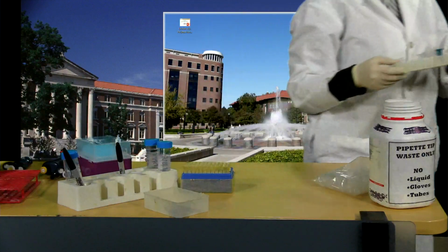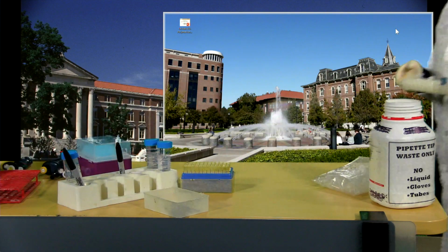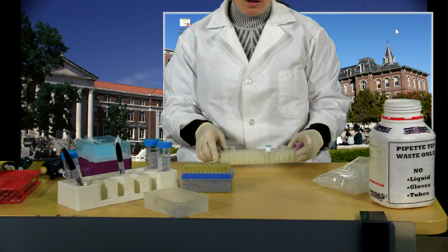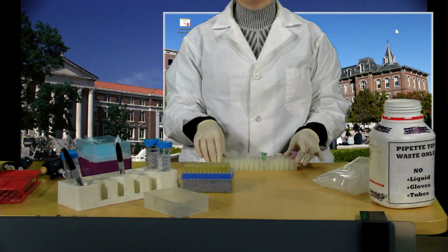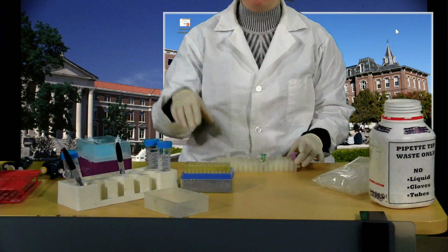Let's just go over here. Okay, these samples need to incubate, like I said, for 5 minutes at 50 degrees.